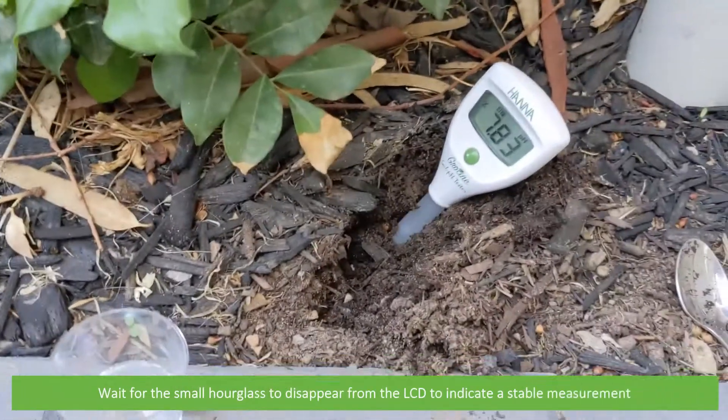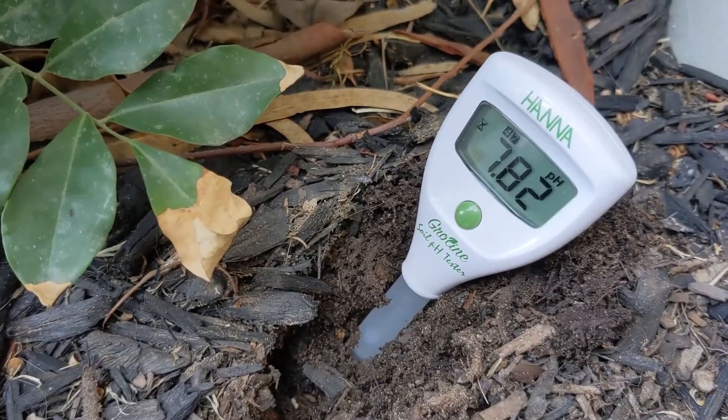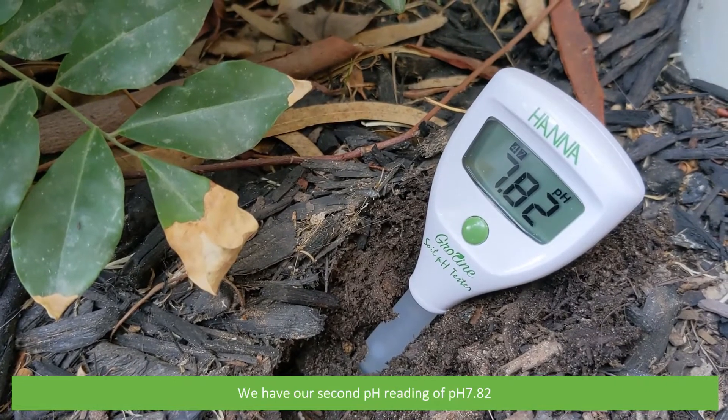Rinse the pH meter in tap water then insert it into the soil. Wait for the small hourglass to disappear from the LCD to indicate a stable measurement. We have our second reading of pH 7.82.